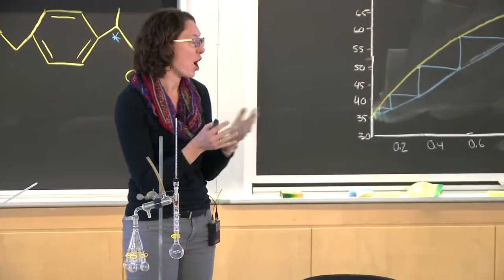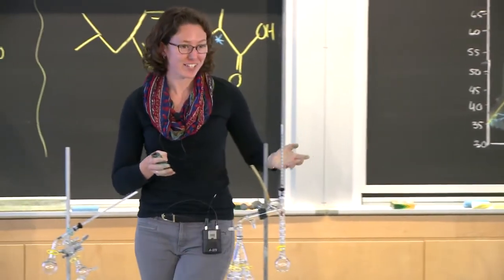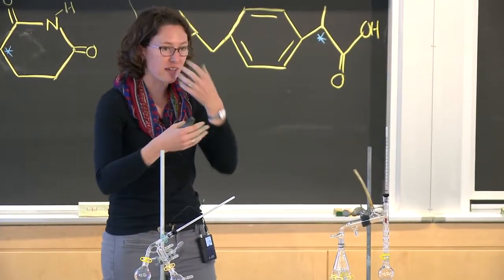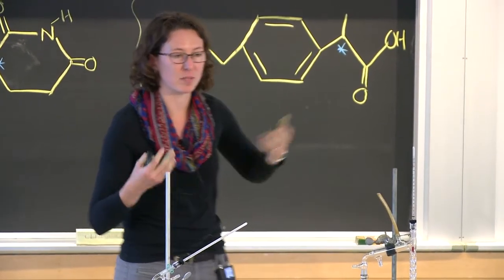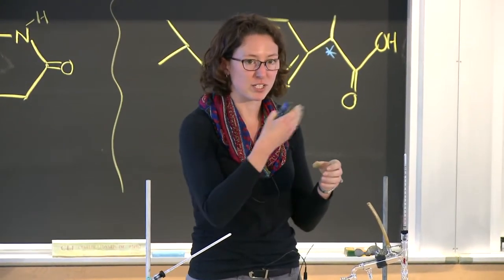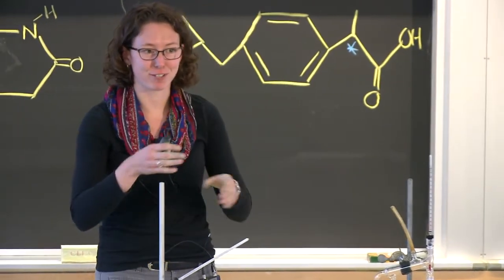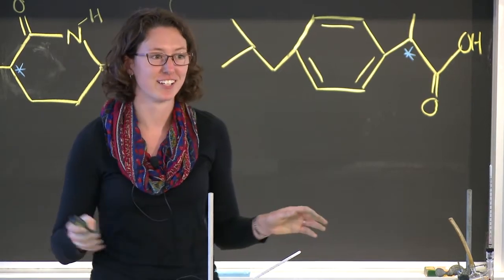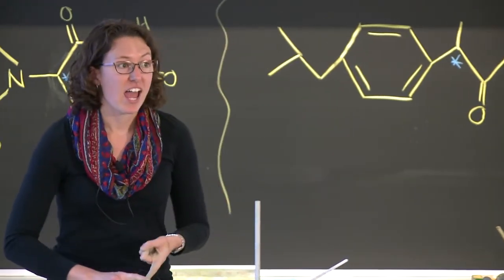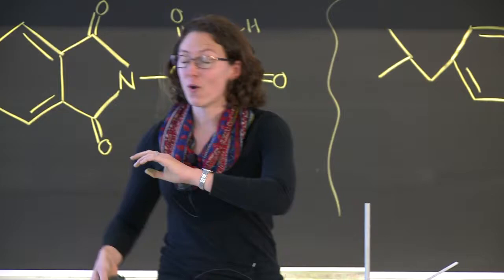So yeah, I mean, part of the way that you can tell is you can smell it, waft it gently, don't ever stick your nose. So whenever you're trying to smell these, even though these are chemicals that people eat, be gentle, you guys know, and your TAs can show you if you're unsure, but don't ever stick your nose straight into a vial of any chemical.